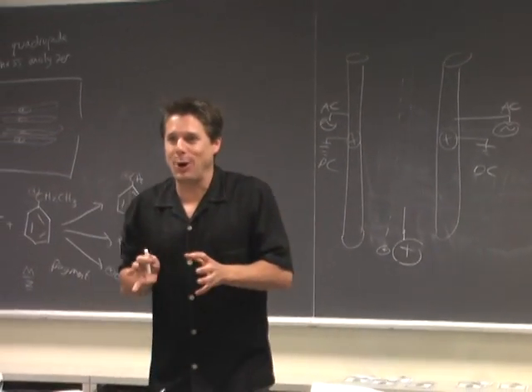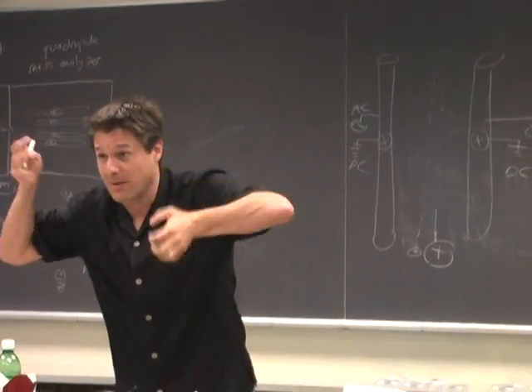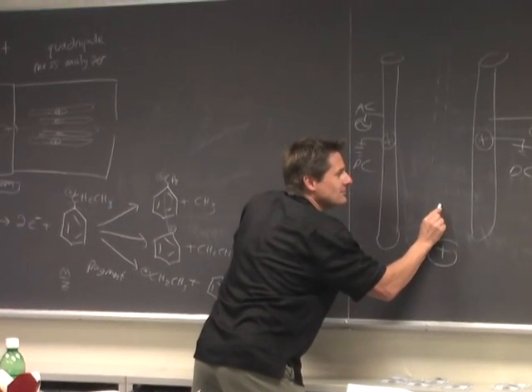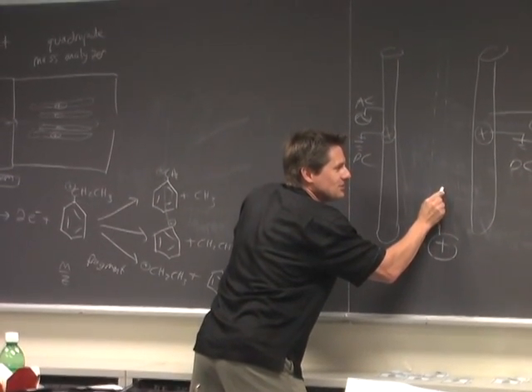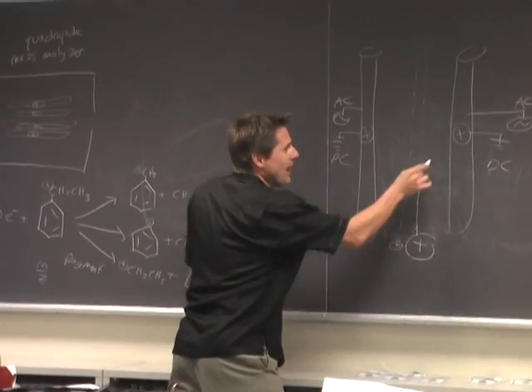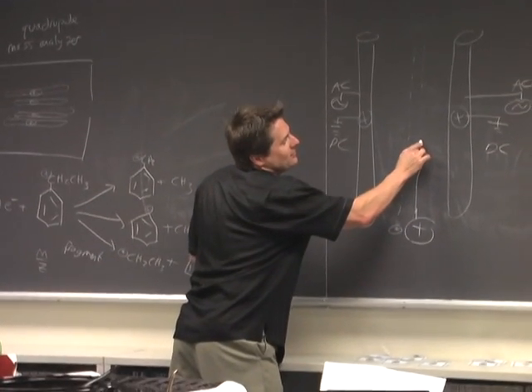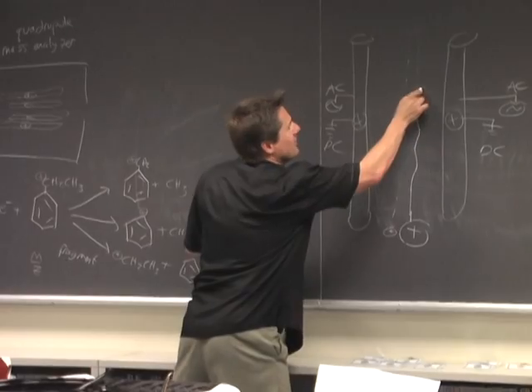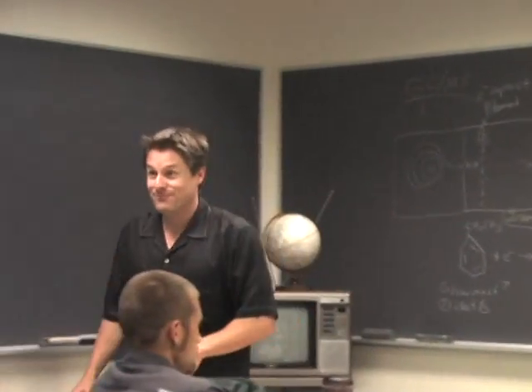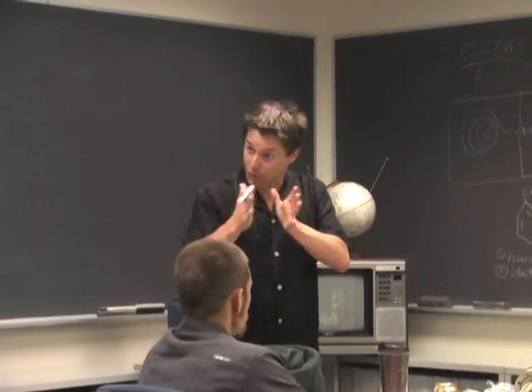How well can the big one turn? It's moving in this direction. Titanic. Okay, now it's attracted to the pole. Turn. It's delayed. So it goes, oh look, it's negative now. Turn, turn, turn. By the time it turns, it's positive again. That damn AC current. So now it's positive. It goes, oh, repelled, repelled. By the time it starts hitting, now it's negative. Turn, turn there. Now it's positive. Now it's negative. Now it's positive. Now it's negative. And by the time it figures out what it's doing, it's out and it got through. That's because it's a massive ion. It can't turn very quickly.